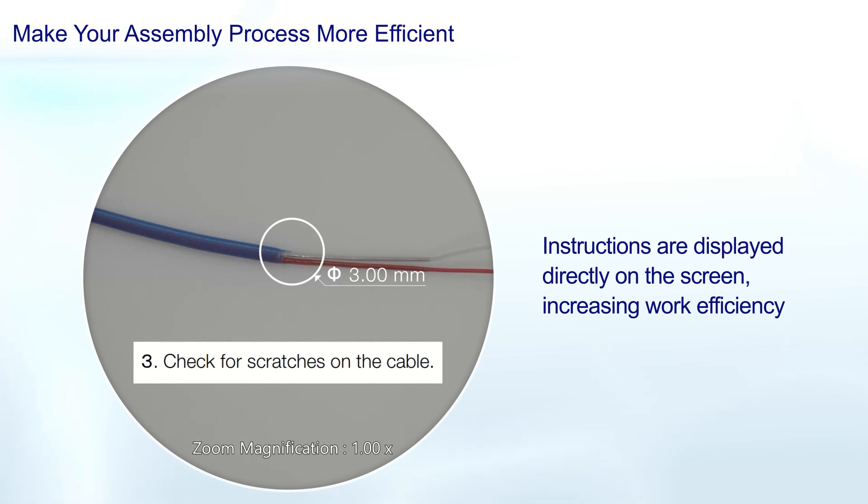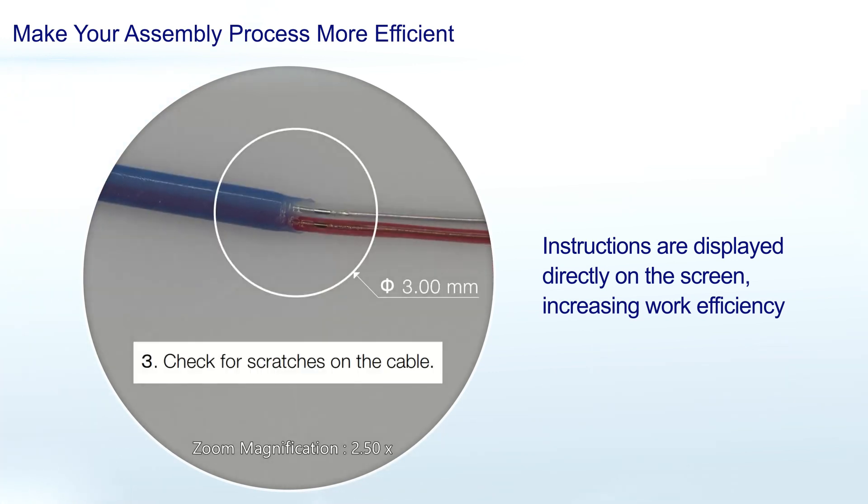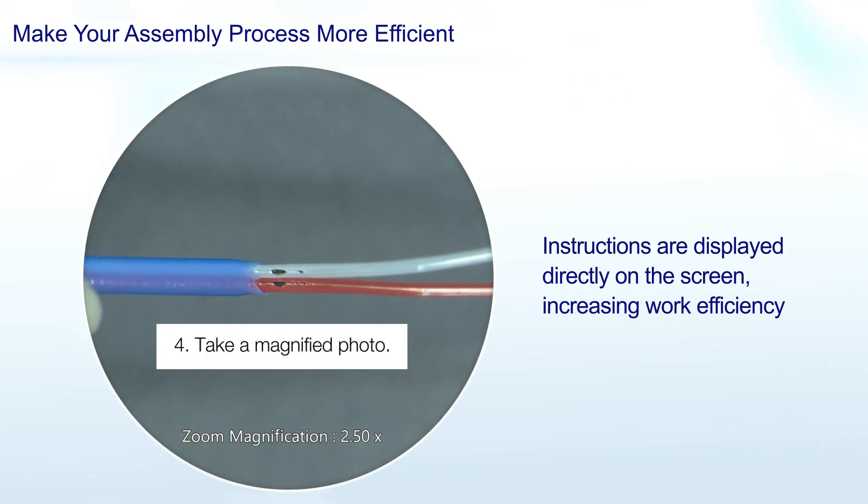For making measurements, the system's digital reticle and gauge can be overlaid on the sample. And when you change magnification, the gauge adjusts automatically.